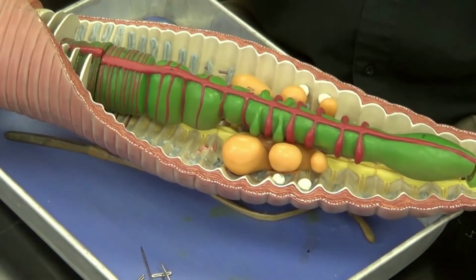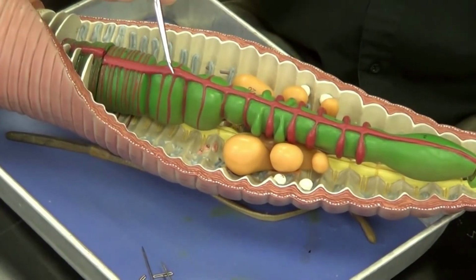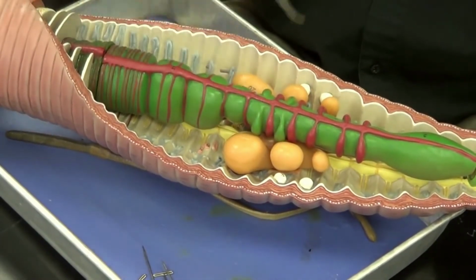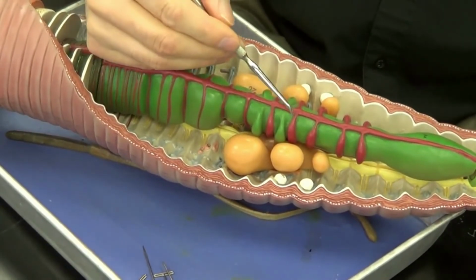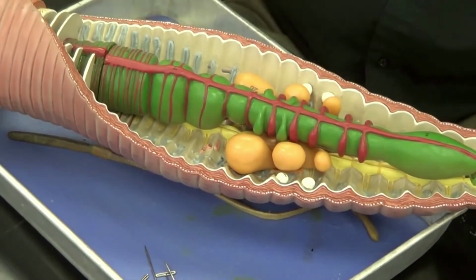And their job, they've been modified to pump blood. They are modified blood vessels, and that's exactly what a human heart is. It's a modified blood vessel, except it's become more modified and more specialized than the heart of an earthworm. Usually you'll have about 5 sets of these hearts. And if you're lucky, you'll see 2 or 3 on an actual dissection.